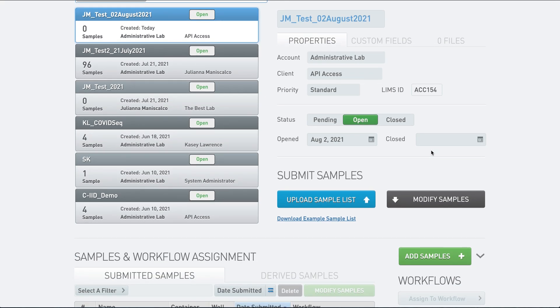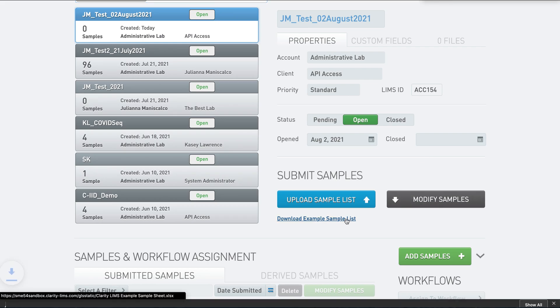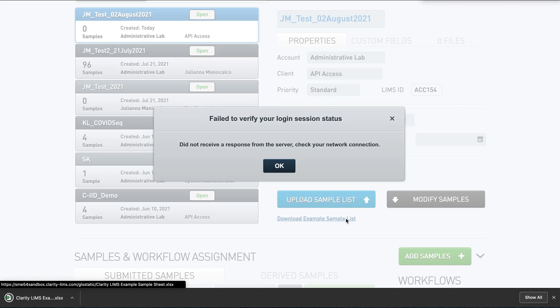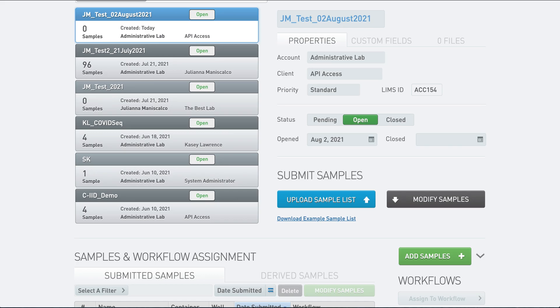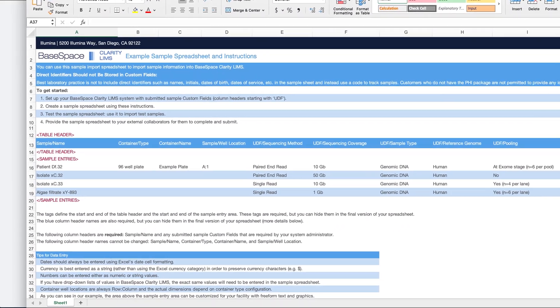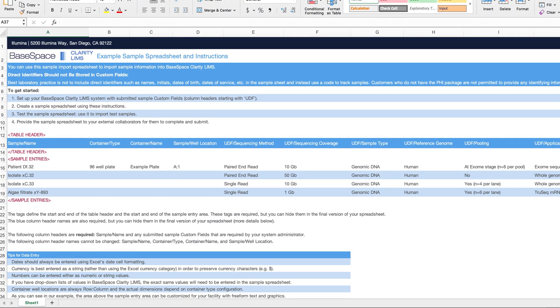If you scroll down, you will find a link called Download Example Sample List. This will download an Excel file. Keep in mind this is just a starting template and it can be edited to have the colors and logos of your own lab.